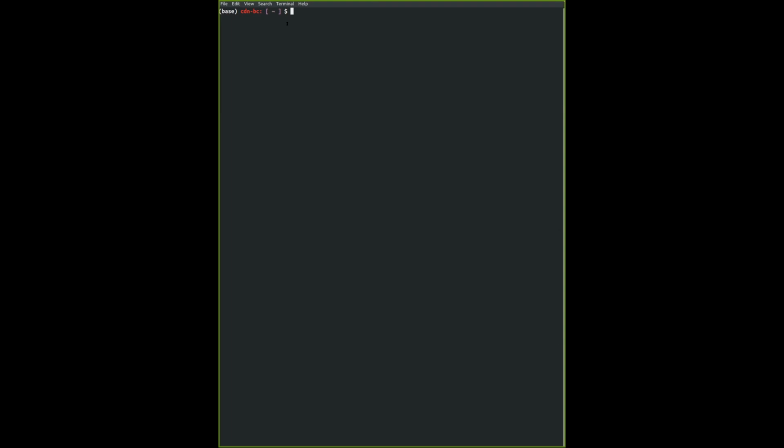Sometimes it might be a bit cryptic, and you might not be sure where exactly you are in the terminal, because when you open up the terminal, there is a default directory that you open up to, but sometimes it can be a little bit different depending on whether you're opening up tabs or opening from a different application. But this gives an idea of where you are right now in the shell terminal.